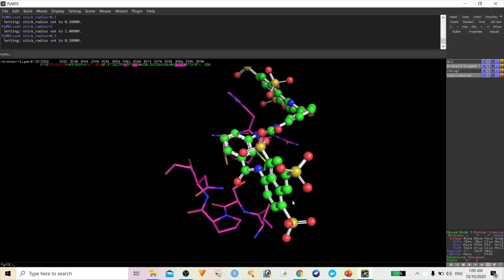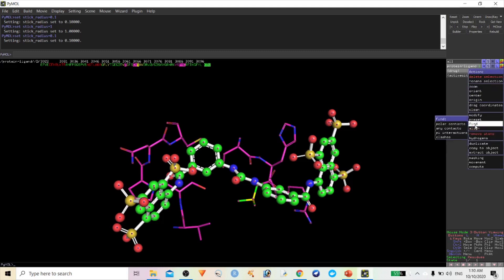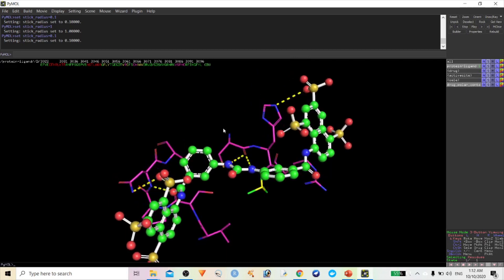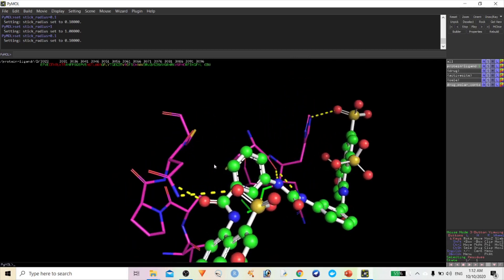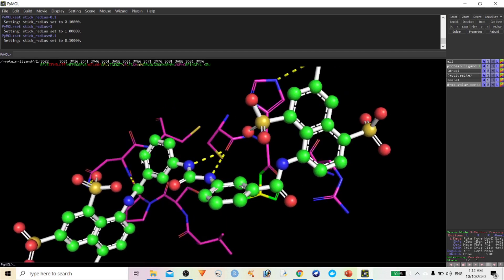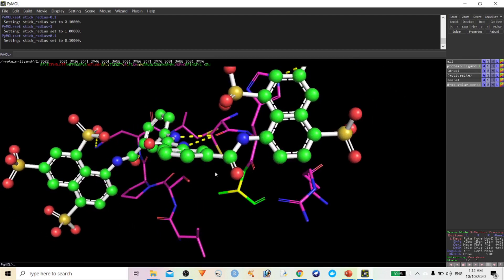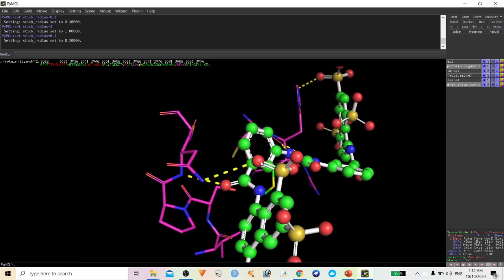Now let us find what interactions are there between this ligand and amino acids. Select your drug molecule, go to Action, and click 'Find Polar Contacts to Any Atom'. You can now see the clear hydrogen bond interactions between this protein and ligand molecule.